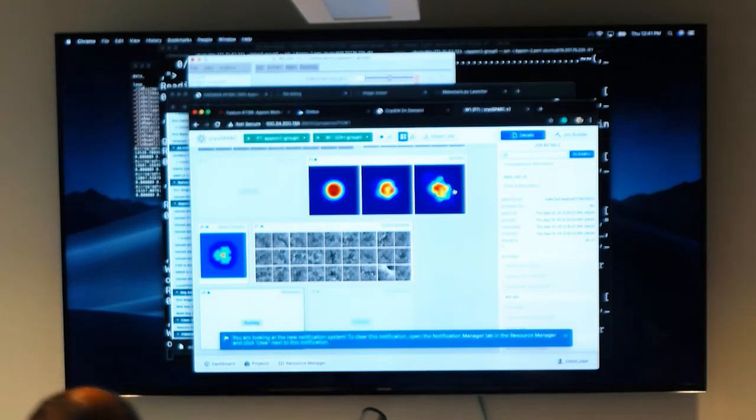So we have 16 GPUs, but given that we're working in pairs, I think everyone would statistically have a GPU at all times to be crunching some data. Did you finish your class? No, I let it complete. It's pretty fast. It only needed 20 iterations.